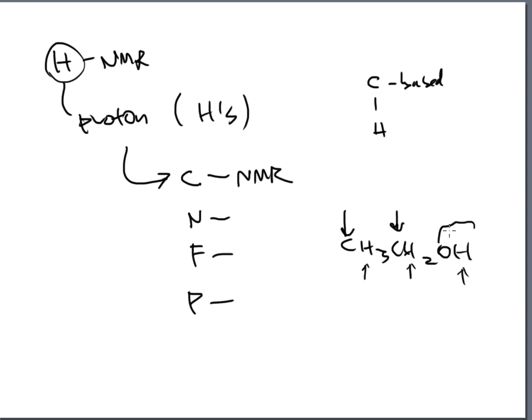So this is one of the reasons that HNMR is always talked about first, because all the molecules will have hydrogen in one form or another. And then the next one in line would be carbon NMR, that some people like a little bit better because it is a little simpler to read and to understand, but you're not getting a full picture of what those molecules are doing at that point.